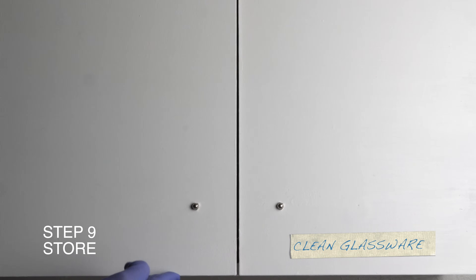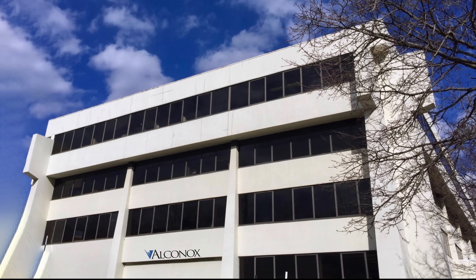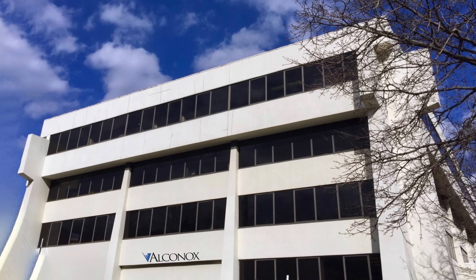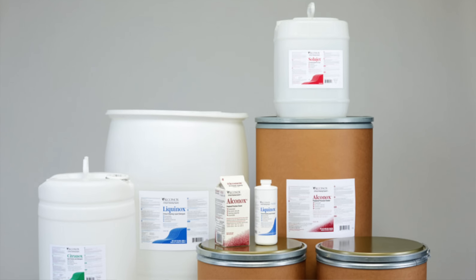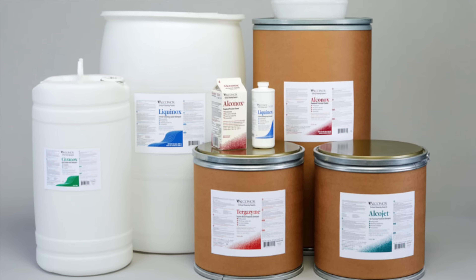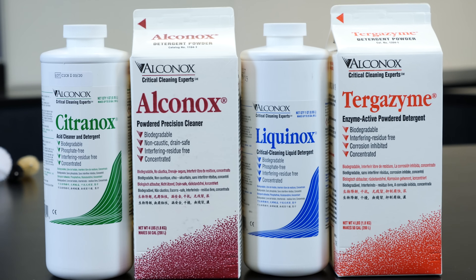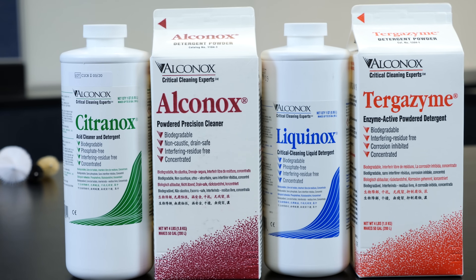Since 1946, Alconox has served engineers and laboratory professionals across a wide range of industries. With over a dozen detergents to meet the highest levels of quality control and technical service, Alconox Inc. has a high-quality detergent solution for every type of glassware, soil, and cleaning method.